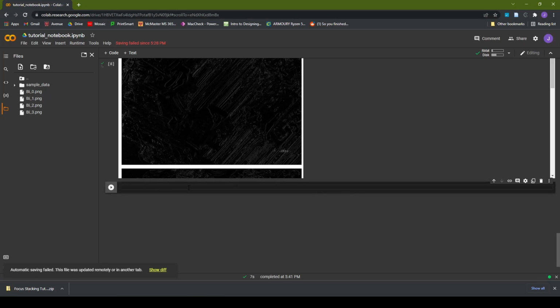And what we're going to do is make a data container, or a list, of all four of our images here. And to do that, we're going to write the following. So images_color, comma, space, images_gray equals load_images parentheses.